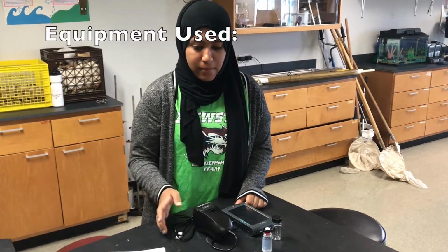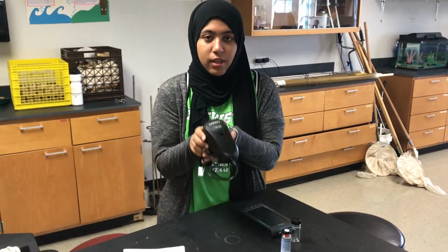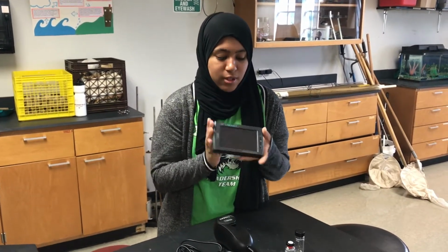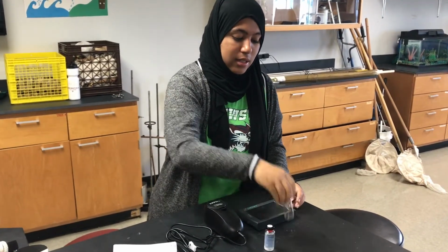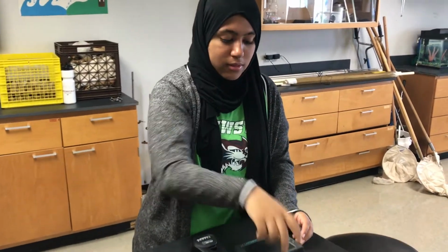So this is the lab equipment we use for the turbidity test. This is the turbidity sensor. We put the sample in to measure the turbidity. This is the LabQuest that gives us the measure of the turbidity. This is the turbidity standard that we use to calibrate the test. And this is an empty cup we use to collect samples. Which reagent is it?